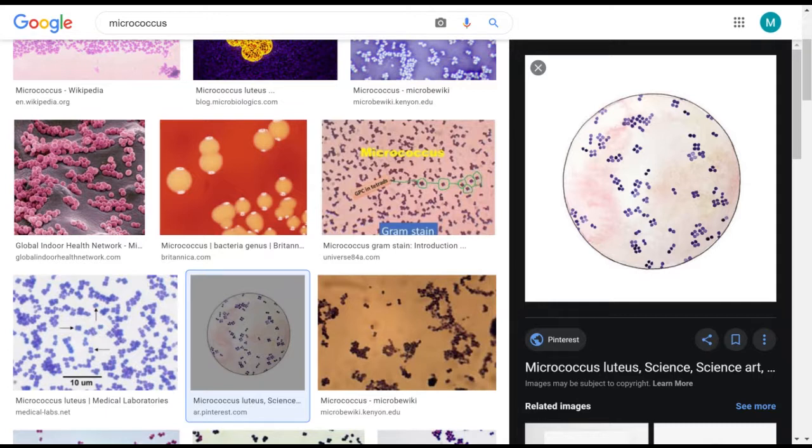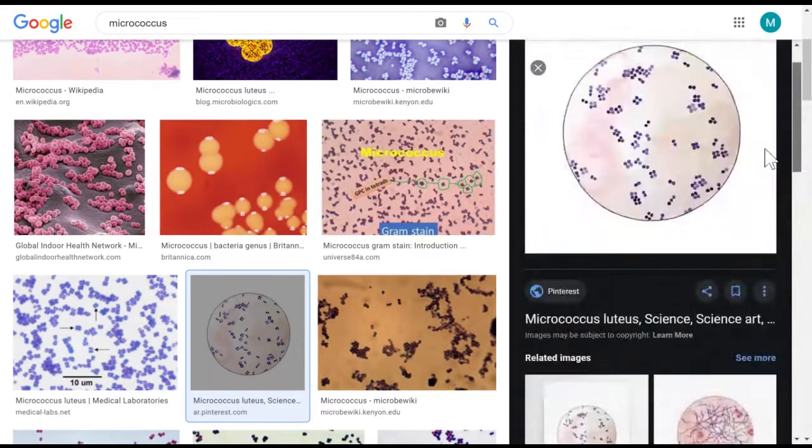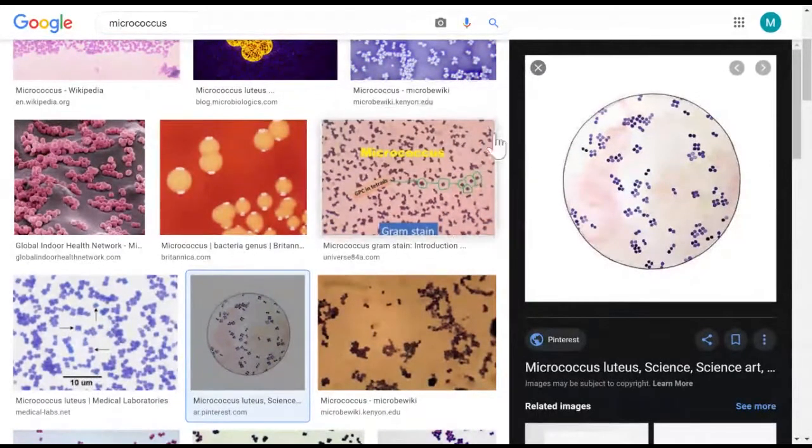You can argue the little pairs of two either divided again to make the tetrad, or maybe they lost the other two. Probably they haven't divided yet because it requires several divisions before you get the actual tetrad arrangement. So that's why they look the way they do. But the minute you see this many tetrads, these guys are tetrads, period. That's hopefully pretty obvious. So don't overthink these. I will definitely find stuff that is obvious. I'm trying to look for a spiral in there somewhere, which hopefully are pretty self-evident too.